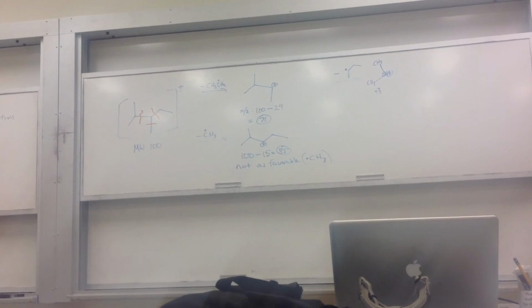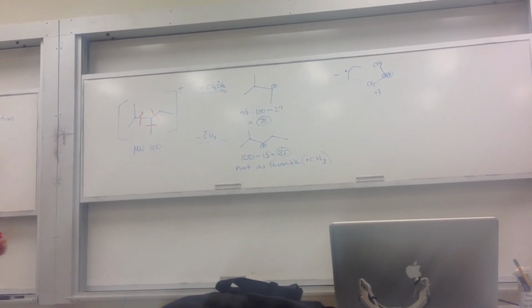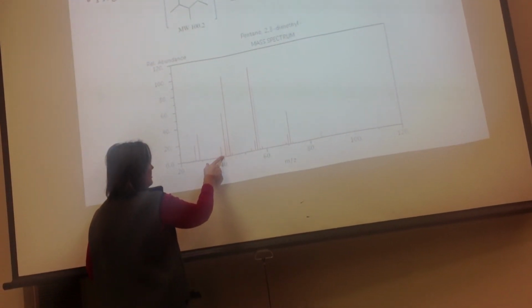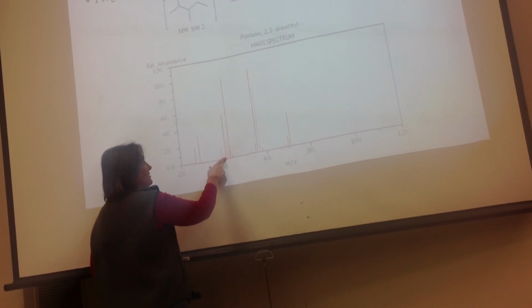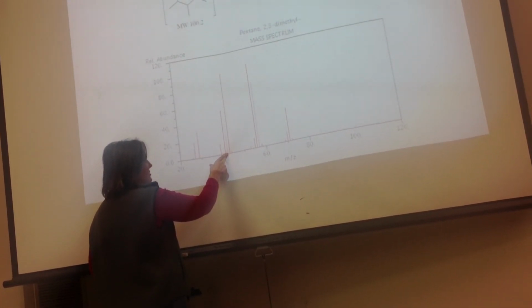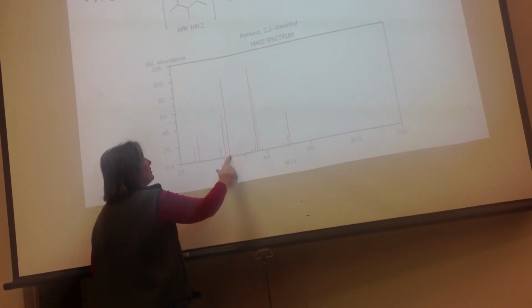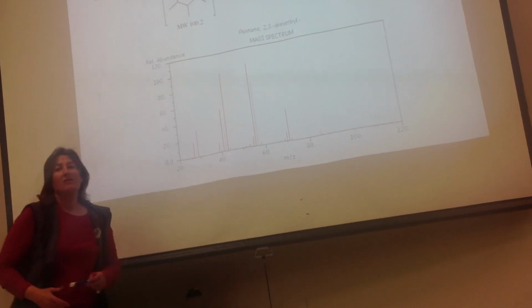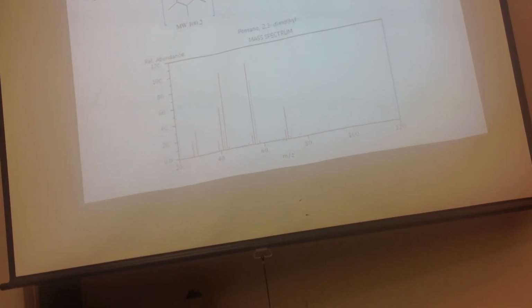Do we see anything at 43? This is like a cluster, right? I see a cluster. But if you count, here's 40, nothing much going on there. 41 is kind of big, but I don't want that one. 42, there's something. Look at 43, it's this big one right here. That's 43. There. So what I see, it's large.